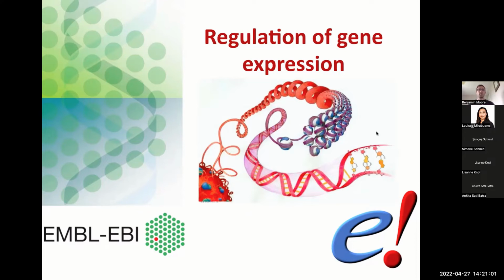Good. Yeah, so there were a few questions that came in on the chat box and in the living document. So hopefully everyone's happy. What I think we'll do now is move on to the next module, which is looking at the regulatory build in Ensembl, so the annotation of regulatory features.